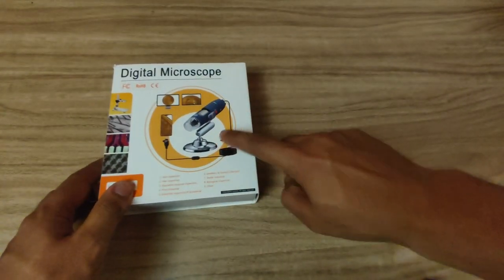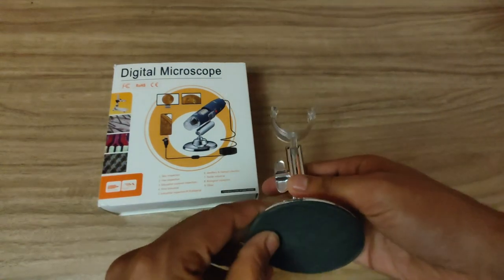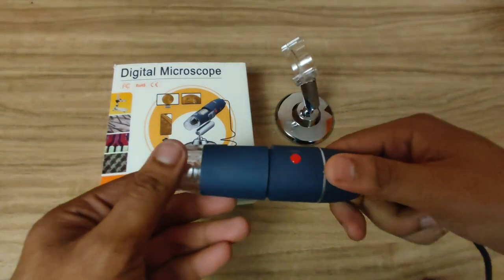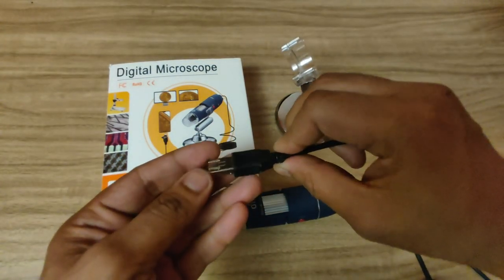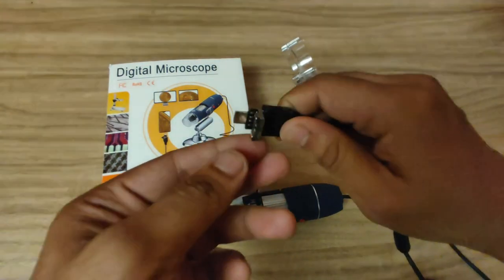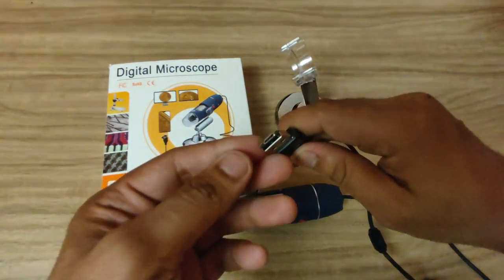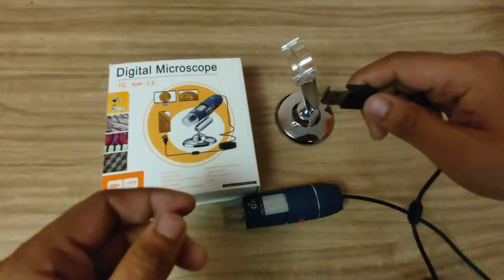With this microscope we are going to get a stand — the quality of the stand is quite good — and also the actual microscope itself. This is a USB microscope. A special thing about it is you can open it this way and you are going to get a micro USB cable, or you can also use it as a standard USB so you can actually connect it with your phone using that method.